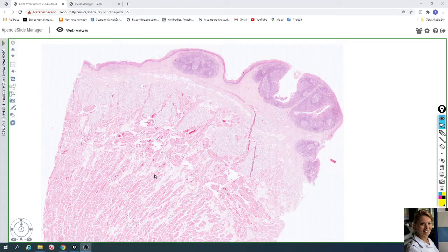In this video we will take a look at the slide of lingual tonsils. The slide is stained by Hematoxylin and Eosin.